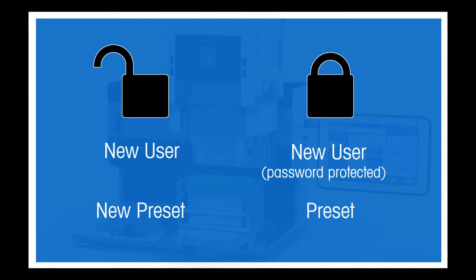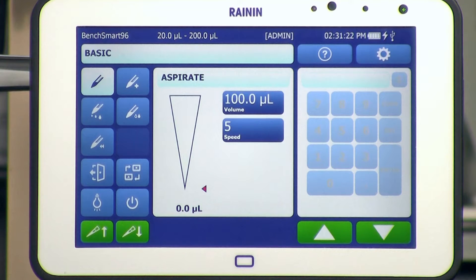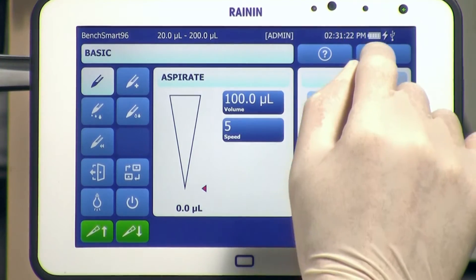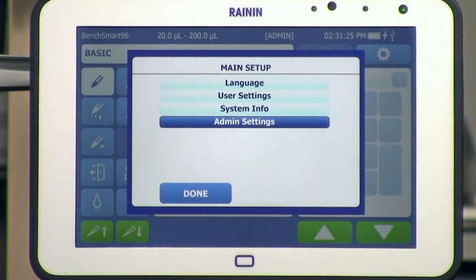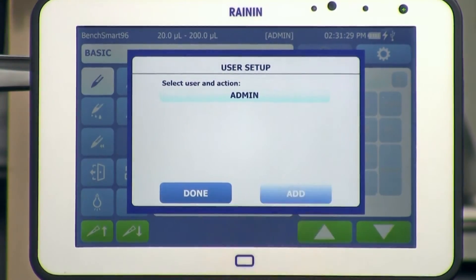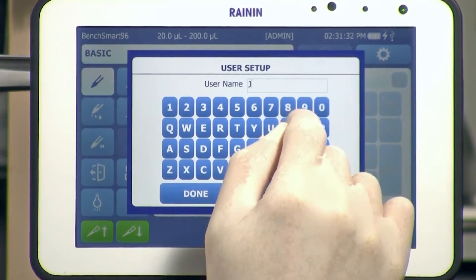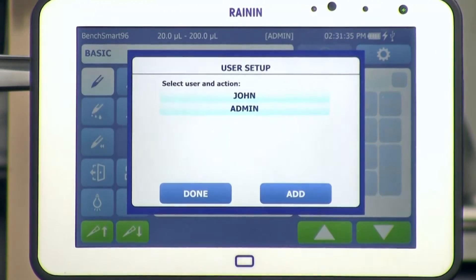Presets that you create when logged in with a password will require the username and password for retrieval. Add a new user by tapping the Settings icon in the upper right of the tablet screen. Tap Admin Settings, then tap User Setup. Tap Add, then type the name of the new user. Tap Done. You'll see the new name in the list of users.